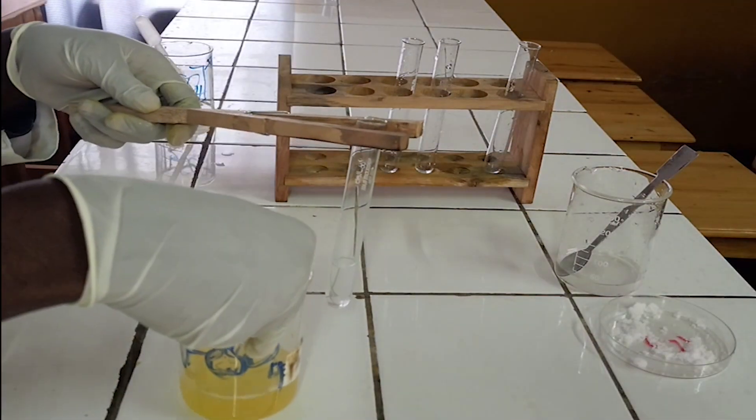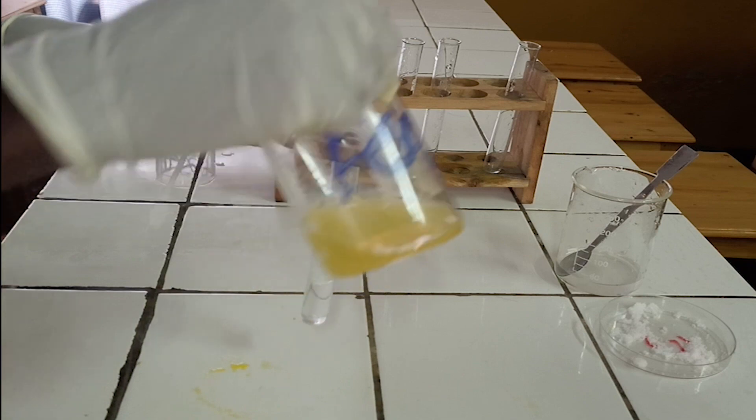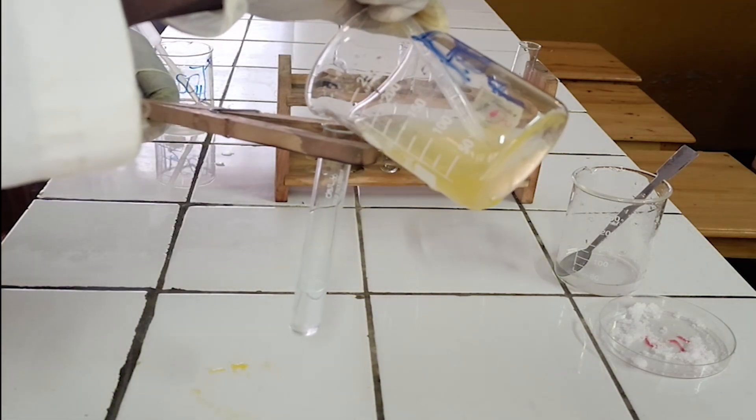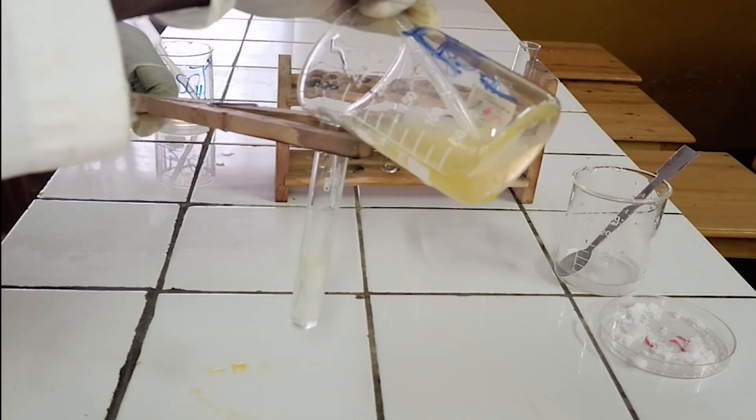To the test tube that contains analyte solution, add around 4 milliliters of iron-2-sulfate solution freshly prepared.